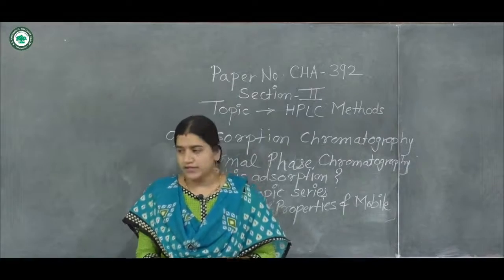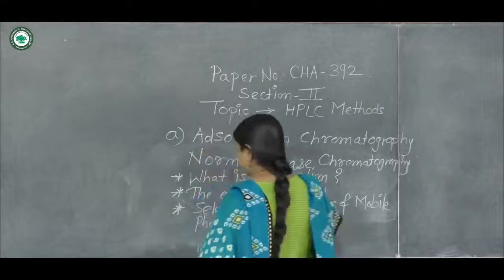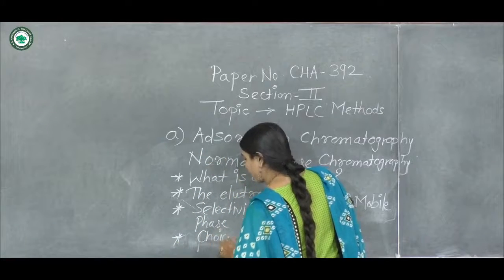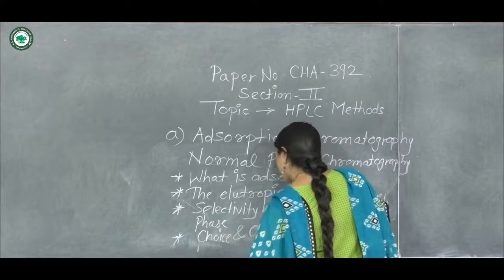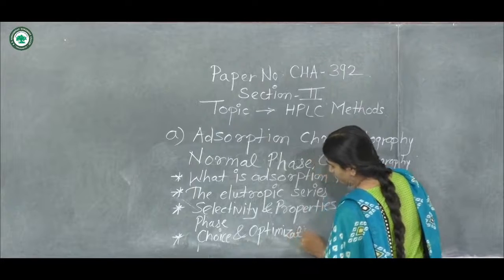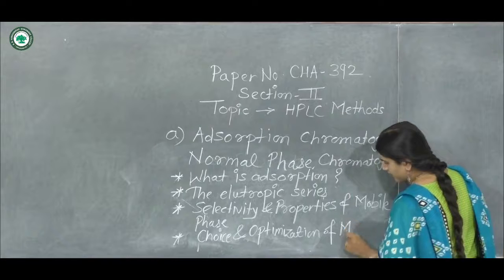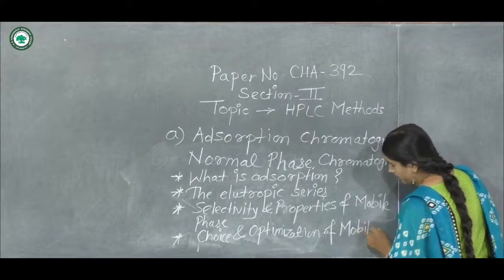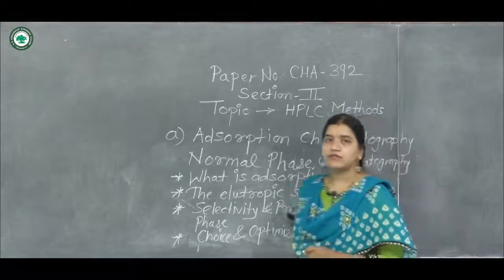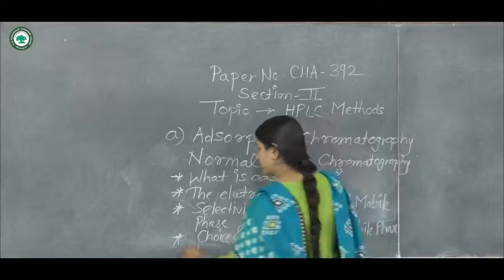Now, the fourth point is the choice and optimization of the mobile phase. And lastly we will discuss the applications.